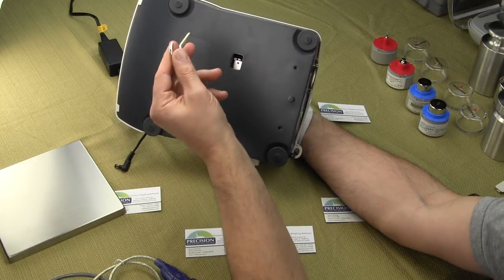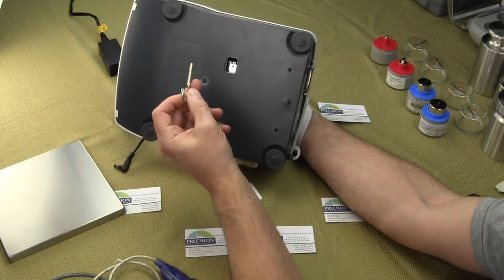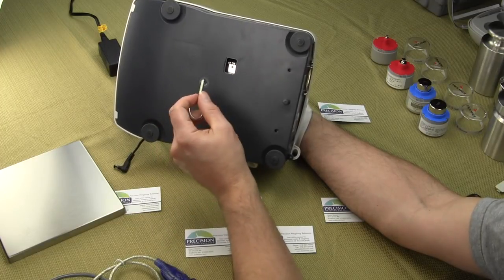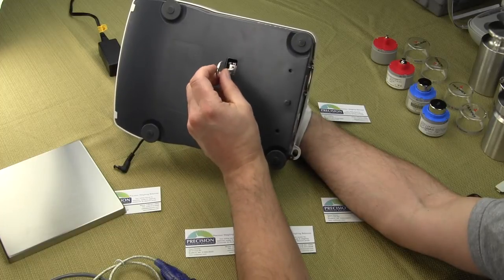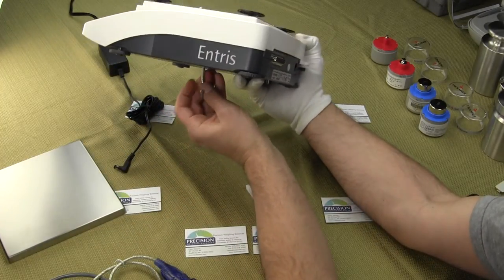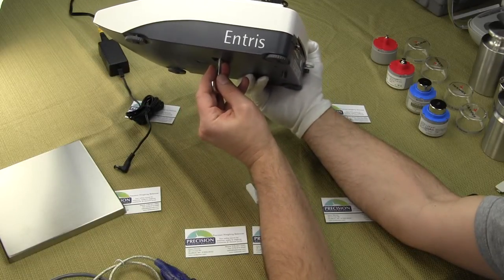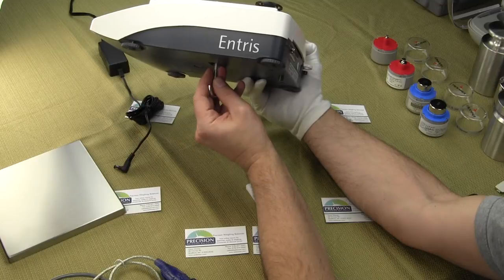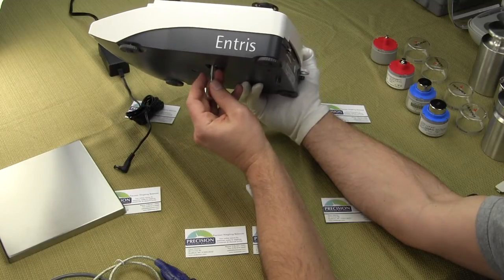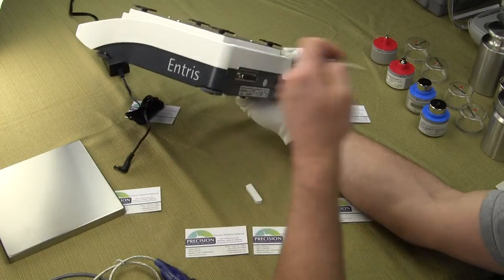Or you can buy the optional underhook. This particular underhook is the wrong size — it goes to another Sartorius balance — but it would be similar to this. I believe this is a 6mm thread and what you need here is a 3mm. But this would just screw right in, and so you'd have your balance and you could weigh beneath. You would weigh for doing specific gravity, or if you were weighing magnetic material, or if you were weighing something very hot — you would hang it beneath the balance.